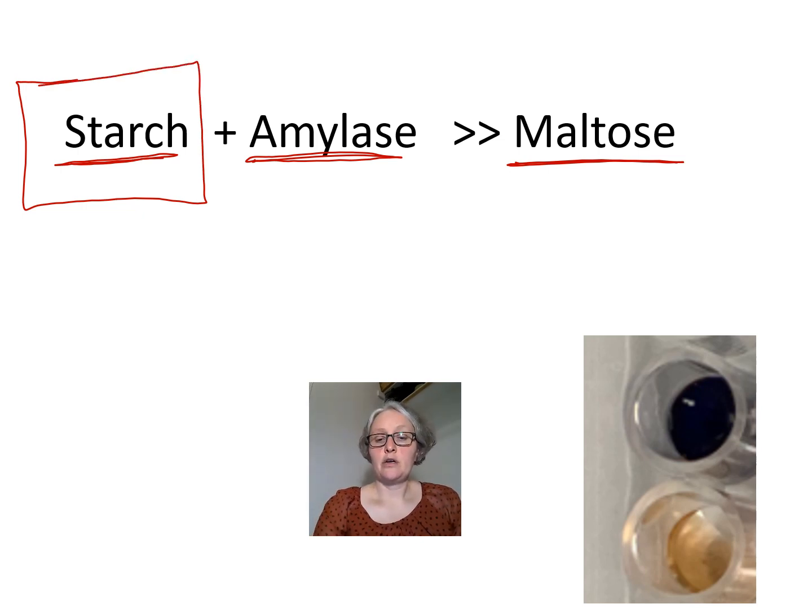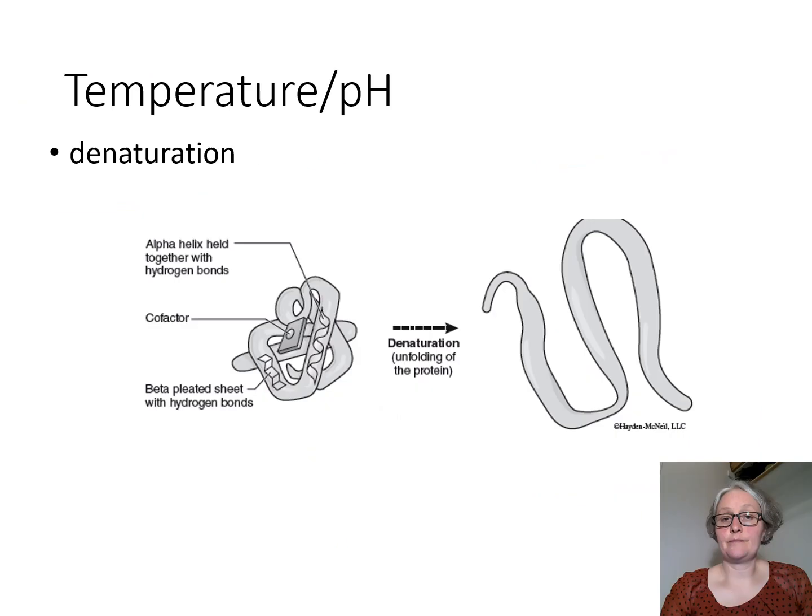Just as a reminder, if the reaction turns black, that means that the amylase is not working. Iodine plus starch means black, so if there's lots of starch, your enzyme isn't working. If, however, your reaction turns yellow, that means that the starch is disappearing, or in other words, amylase activity is functioning. We wanted to, in Unit 6, figure out different factors that might influence enzyme activity.